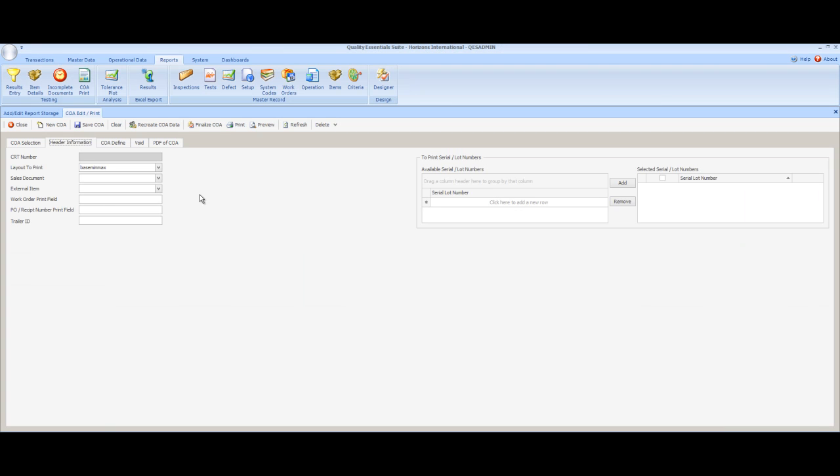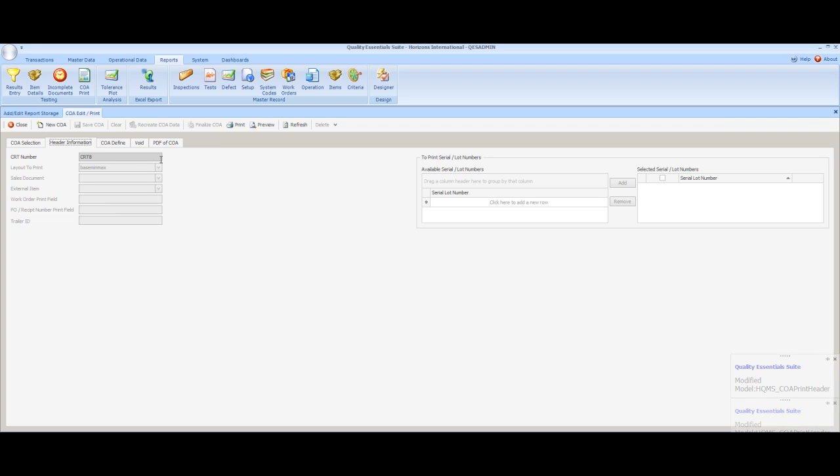As the last step in our C of A process, we can go ahead and select the Finalize C of A button. When we click on that button, a certificate number is automatically assigned to this certificate of analysis. And the PDF version of the report is saved and placed in the database.